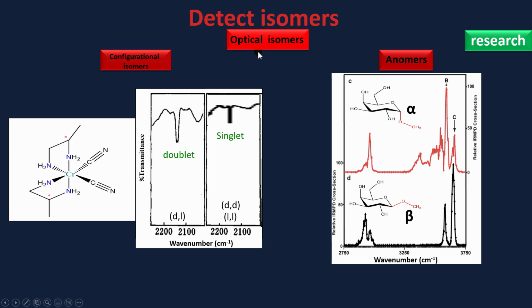In biological applications, some drugs with the S configuration are inactive drugs, while their R configuration is active, and vice versa. So we use chromatography to separate the two isomers, then use the IR spectroscopy to identify them.